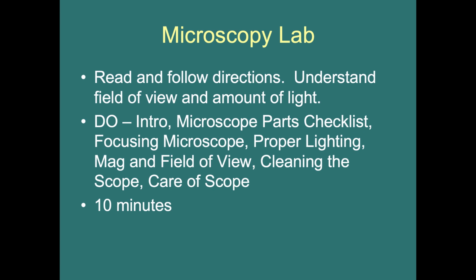Don't forget, your microscope is like a little baby, and so you're going to have one arm on the arm and one hand on the base, and you're going to carry it and care for it. You're not going to slide it around the table. You're going to set it down gently, leave it there, and you and your lab partner can look back and forth through the scope. But please don't slide that around, and always replace the microscope cover. And when you're done, put it back in the case in the back of the room.